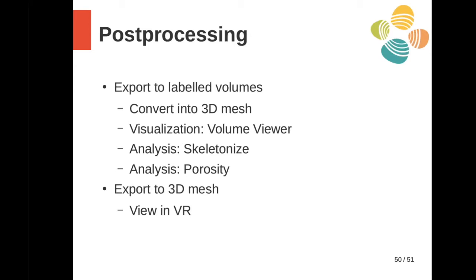What are some of the things that we might be able to do with it? Well, we can convert it into a 3D mesh so that we can view it inside rendering software like Blender, or even Avizo supports that. Avizo, of course, also supports viewing the volumes directly as a volume viewer. We might want to do analysis for it, such as skeletonization or porosity, or we can export that 3D mesh to view in VR.